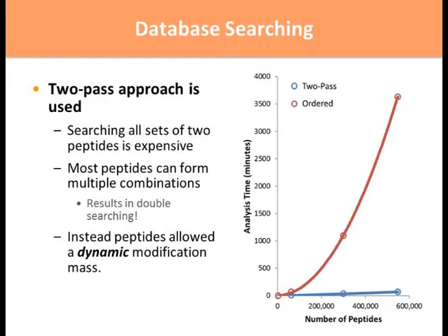And what that does is it searches all of the data sets and tries to derive initially from these peptides which are the best ones to look at, and then also works out what that fragmentation pattern is, and then gives you identification. So what happens here is it's more of a linear computational expanse rather than exponential expanse.